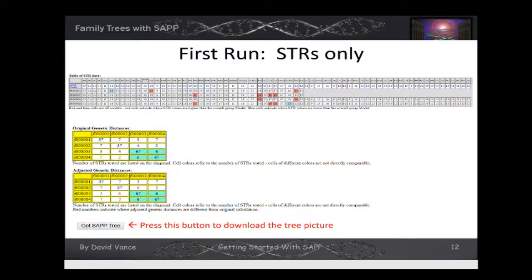So the output consists mainly of a set of tables first. This first table up at the top is a repeat of the STRs that you entered. We have the 4 kits here and we have all their STRs. The first 2 are only 37, then the second 2 are 67. It will calculate what's called the group modal haplotype on the top, which is the most common frequency of the numbers down below, and it will show you the off modals, either lower in blue or higher in red, against that modal. That's a very common way to show the kits and reflect the changes in the kits.